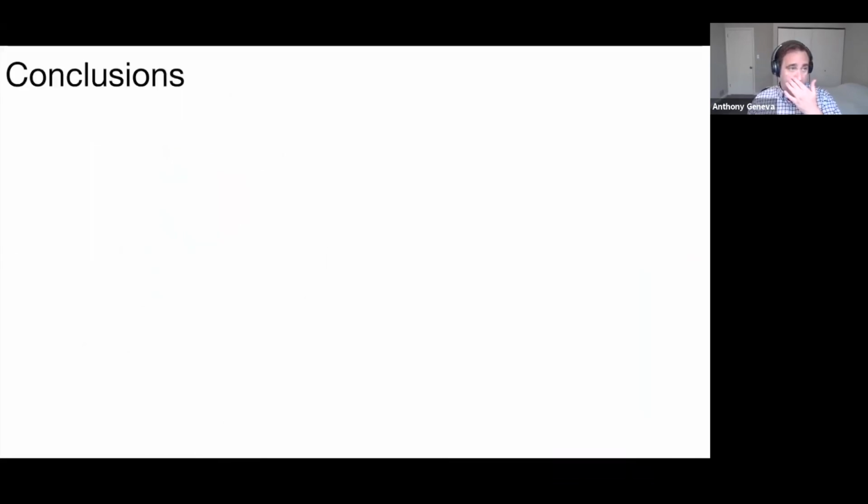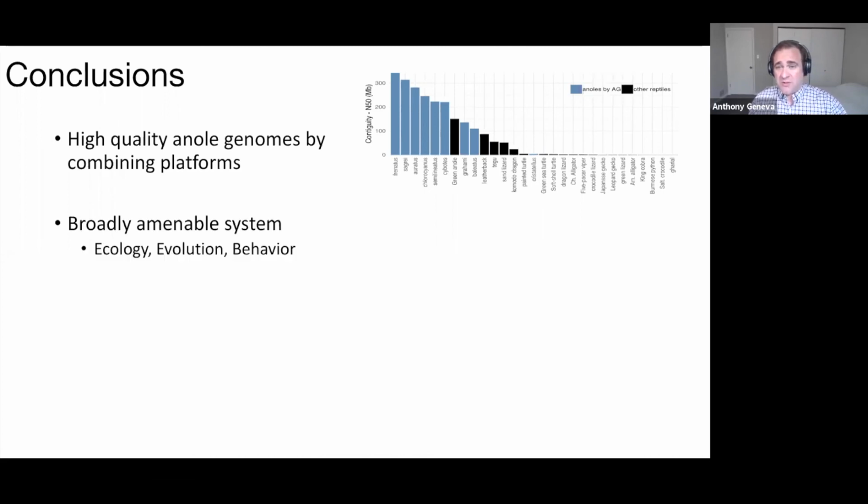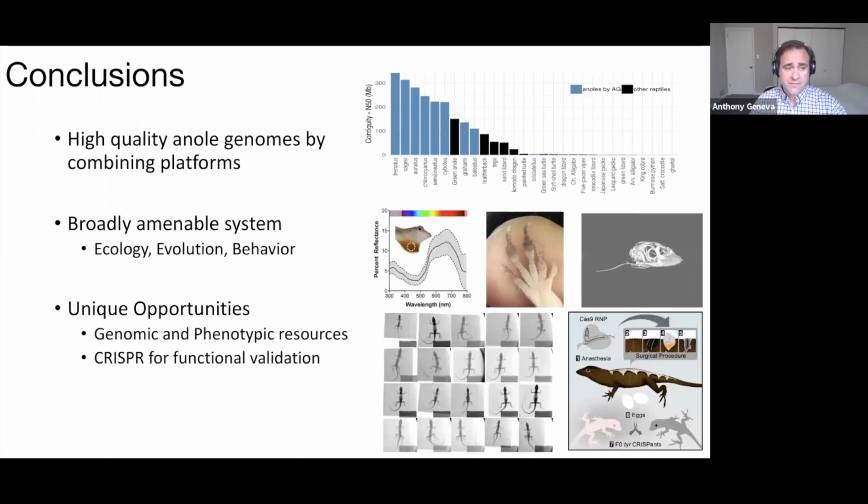A couple of quick conclusions as I wrap up here. We're able to generate really high quality anole genomes by combining platforms and really leaning hard on Dovetail technology. We work in a broadly amenable system that's used for a whole lot of different research purposes: ecology, evolution, behavior, functional genetics, development. And we have a unique opportunity. We have a rich set of phenotypic resources. We've just now developed this really wonderful set of genomic resources.